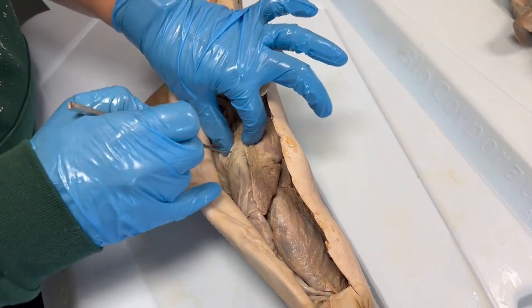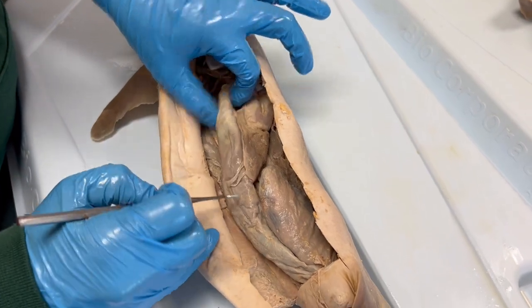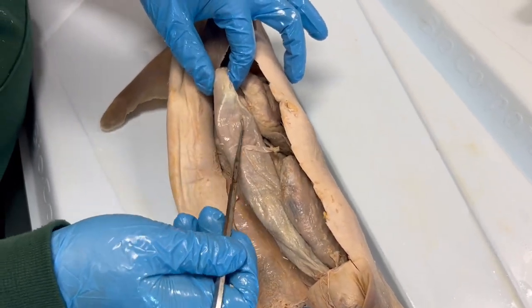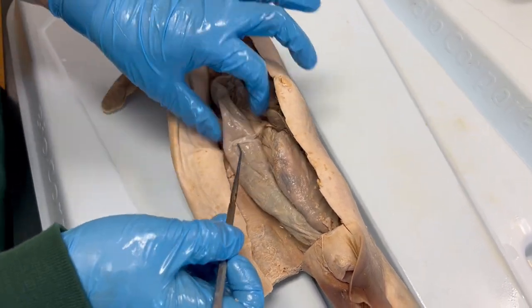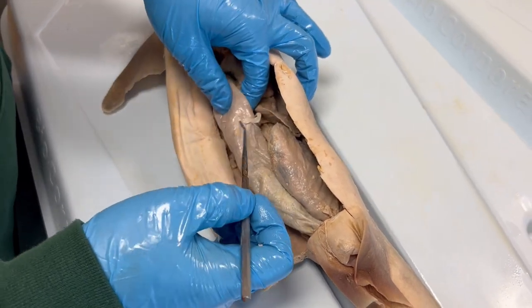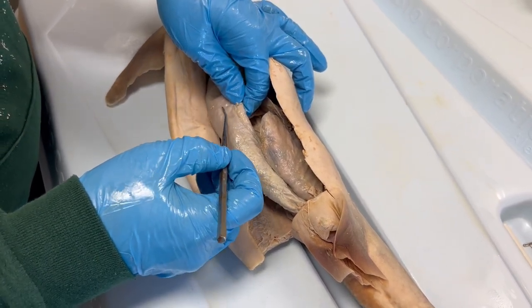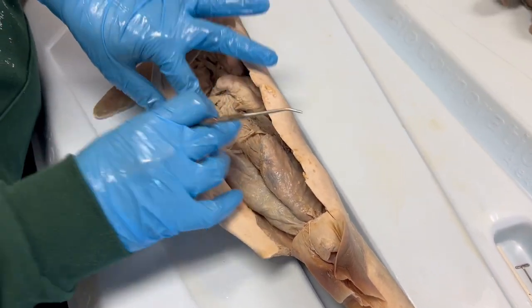Working our way caudally through the digestive tract, this is the spiral intestine. Even though it may look like a very straight organ, within the intestine is a spiral of tissue that greatly increases the surface area. The intestine is filled with capillaries and other small blood vessels to carry digested nutrients into the bloodstream to distribute around the shark. Having a great deal of surface area is really useful for the shark to efficiently absorb nutrients from their food.